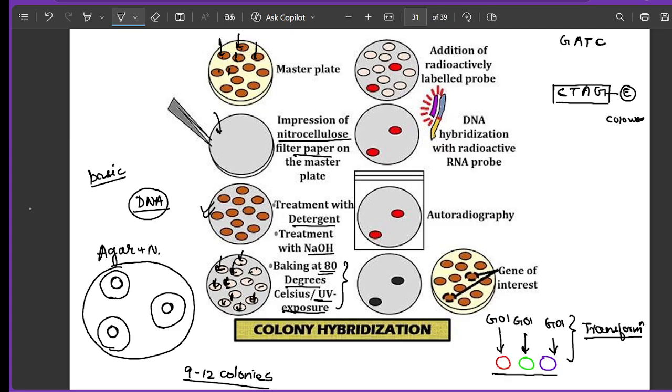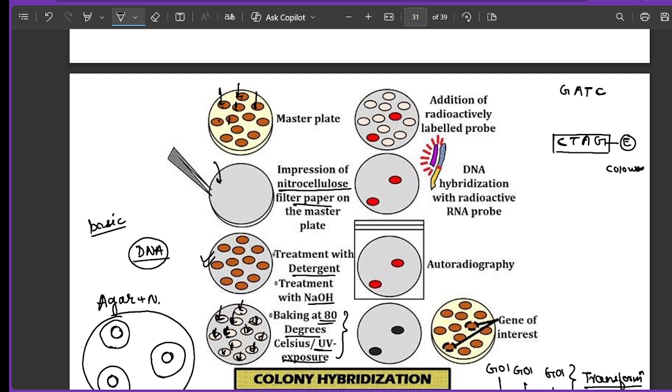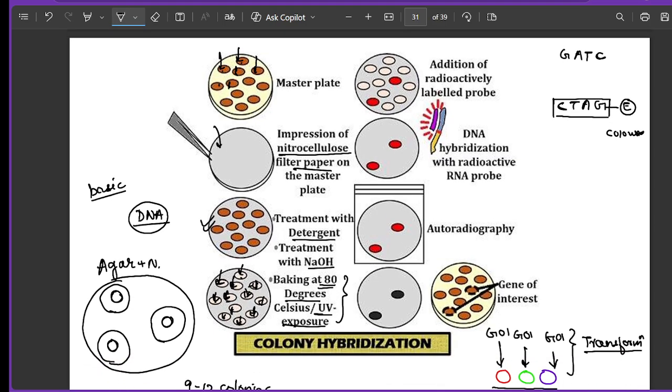This probe can either be enzyme bound, or a colored probe, or a radioactive probe. Now you will take the probe solution and introduce drops on every one of the DNA spots. Those DNA which were recombinant and had the desired sequence, the probe will come and bind to them, and it will permanently stick because the actual DNA was also already stuck. The normal DNA, which did not transform, will not have the gene of interest sequence, so the probe will not find complementarity there.